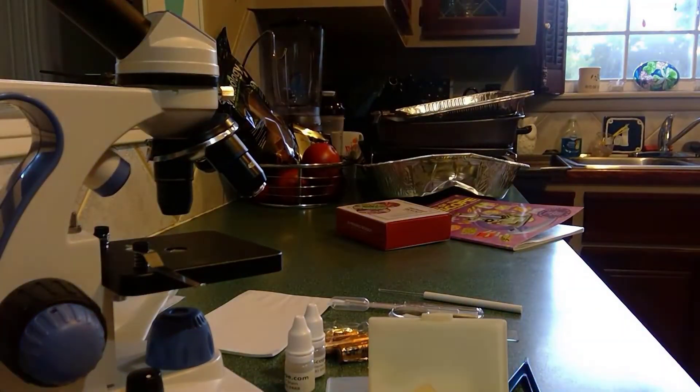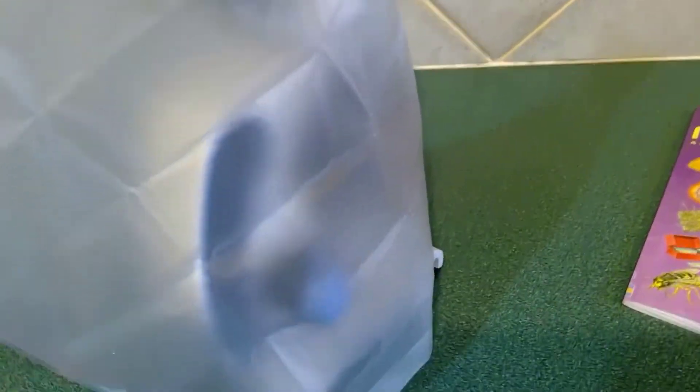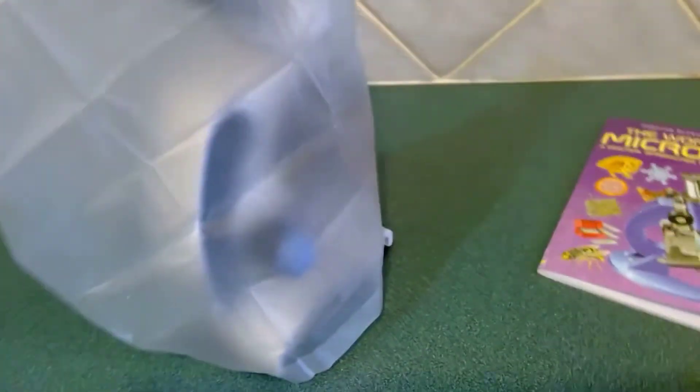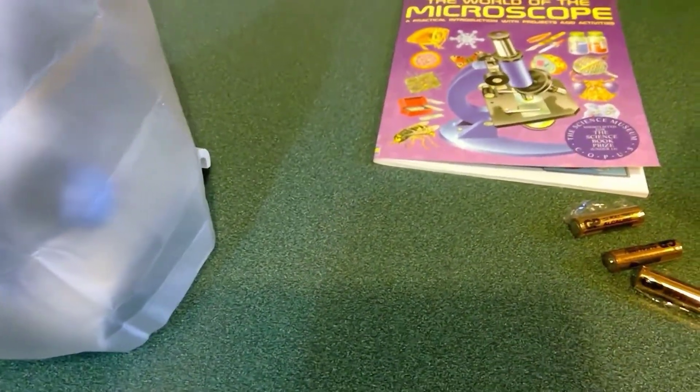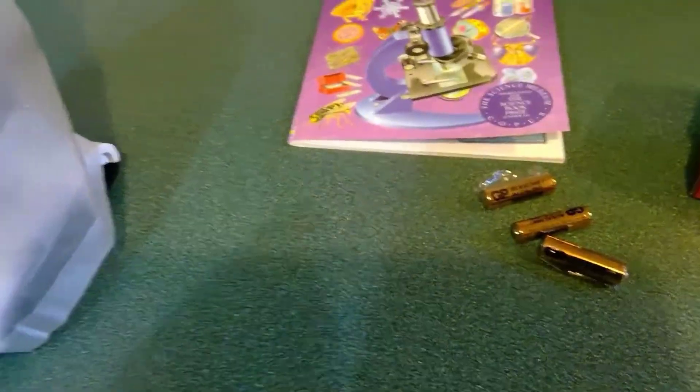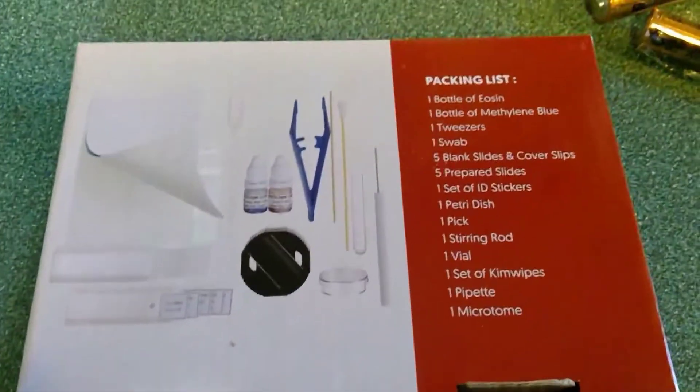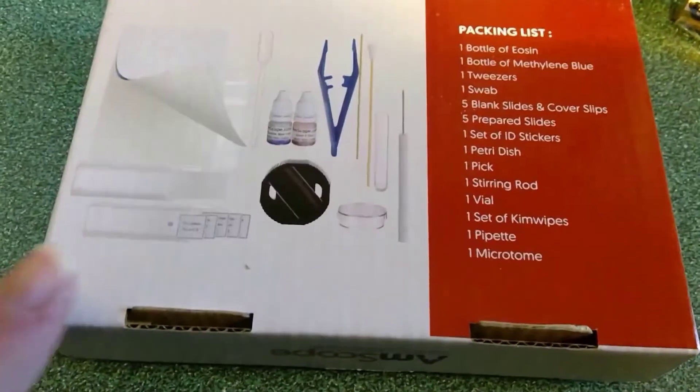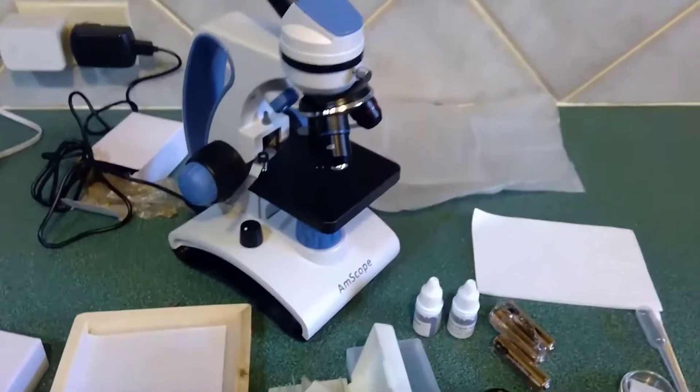Also, this comes with a microscope cover, which is great so that it doesn't get all dusty. It's a pretty thick cover and it goes all the way over the microscope. So I wanted to show that it was included as well. And I also wanted to show you that I looked on the back of the Amscope box, and it's actually, it comes with, I couldn't figure out which slide it came with, which set. And you can see on the slide, on the box right here, which one it comes with. It comes with these right here.